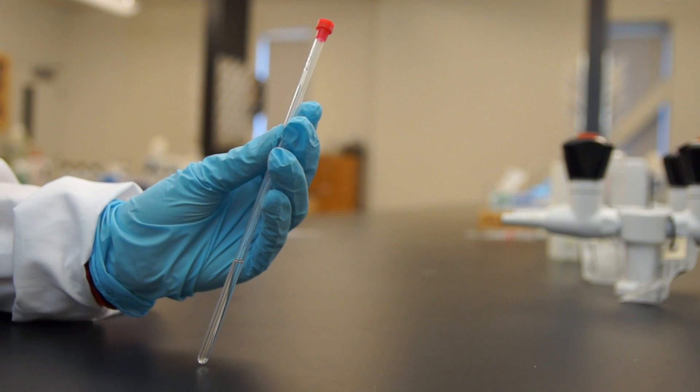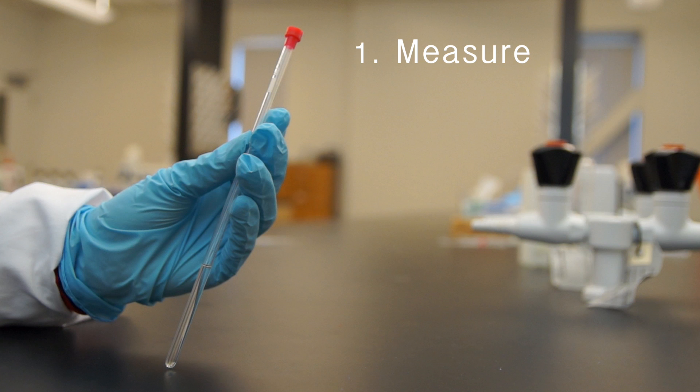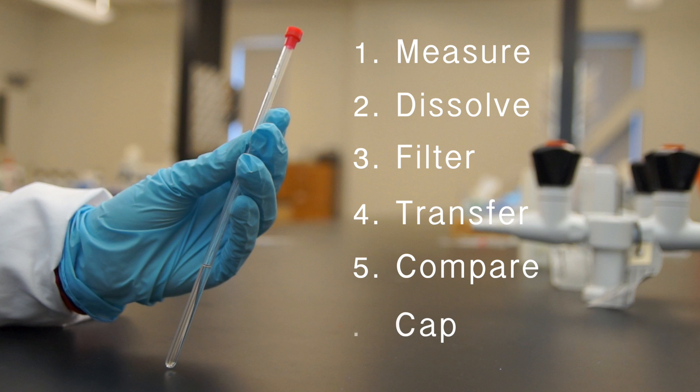Here's what your finished sample should look like. To summarize: first measure out your sample, then dissolve it in the NMR solvent, filter it if necessary, transfer it to the NMR tube, compare the solvent height to that of the solvent height guide, and then finally cap your tube properly.